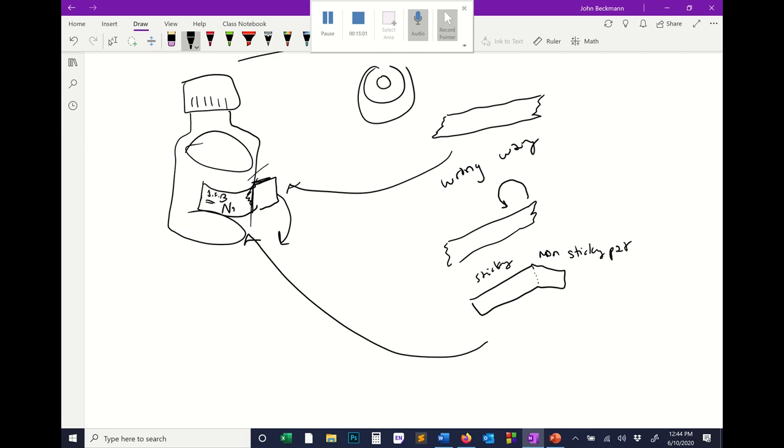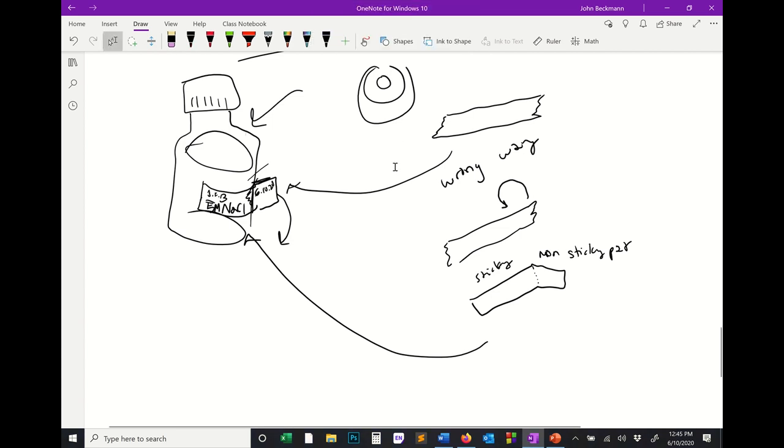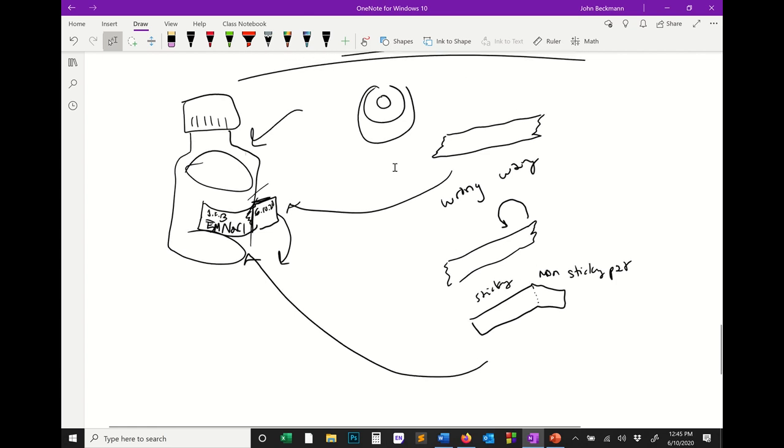You write what it is. It's sodium chloride, and it's 5 molar sodium chloride. Okay, got that. And now the last thing you need to write is the date. So 6/10/20. Now this bottle is effectively labeled and we have made our first solution of 5 molar sodium chloride. You are now on your way to doing experiments in the lab. Congratulations.